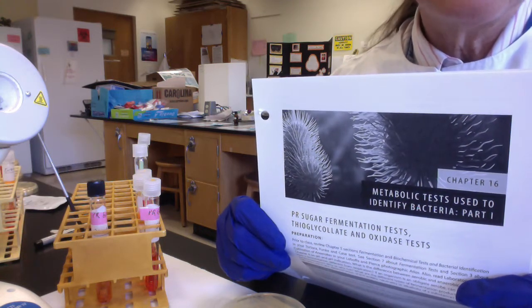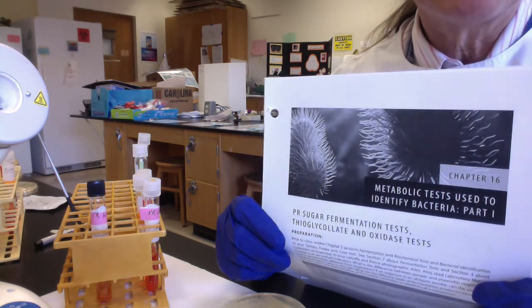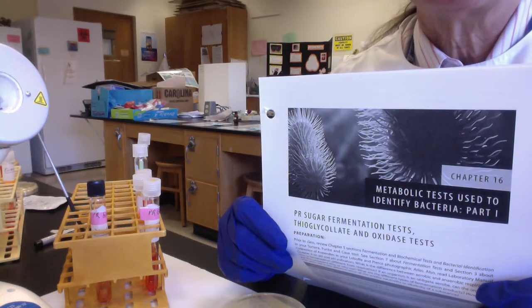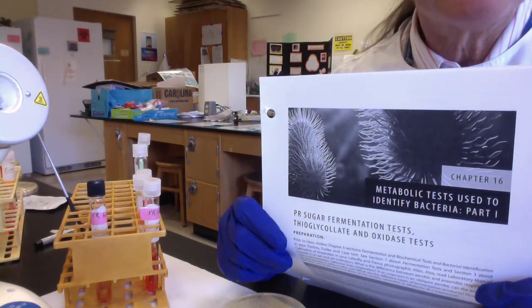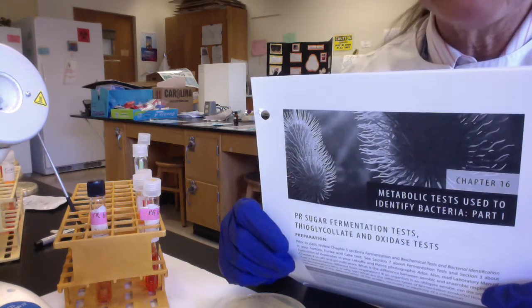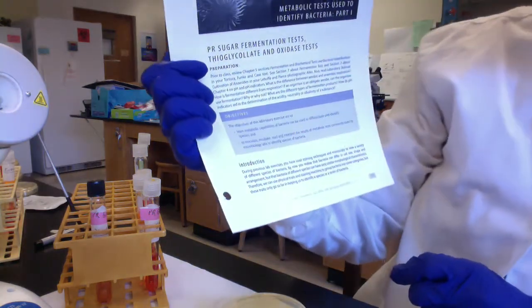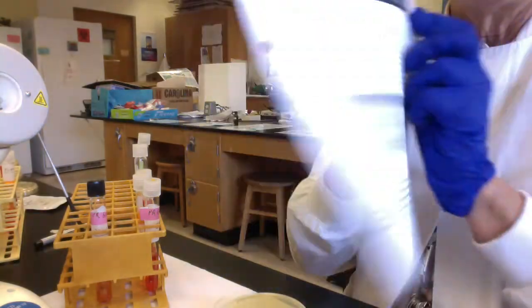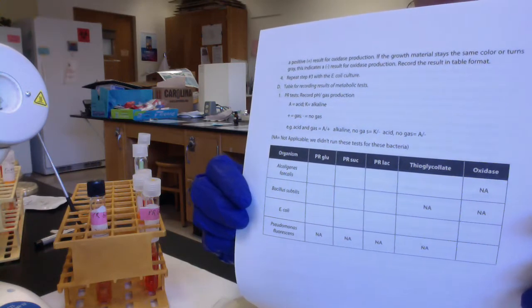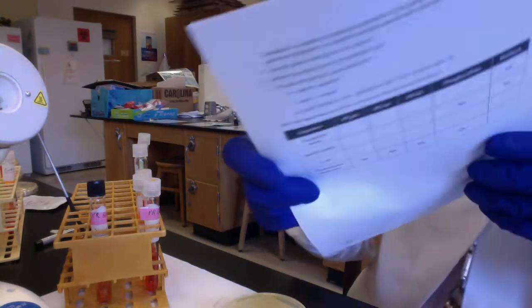I won't video record all of the inoculations because they get pretty repetitive, but we'll try to give you an introduction to the medium, and then we'll have a follow-up PowerPoint that will give you more details. And certainly, folks, read Chapter 16; all the information will be in Chapter 16 of the lab manual. In spring 2020, Chapter 16 starts on page 173, and a table showing the organisms that we would have inoculated and which media we would have used is on page 178.